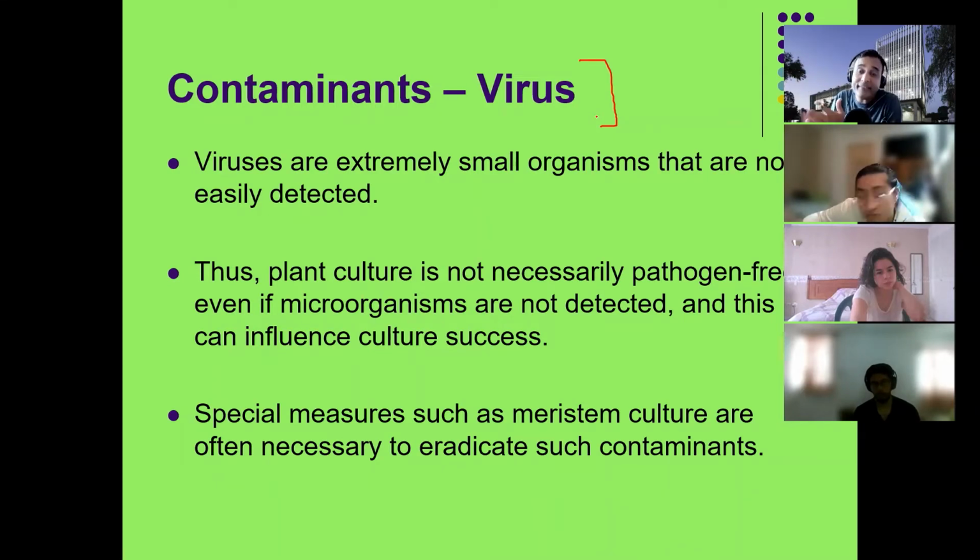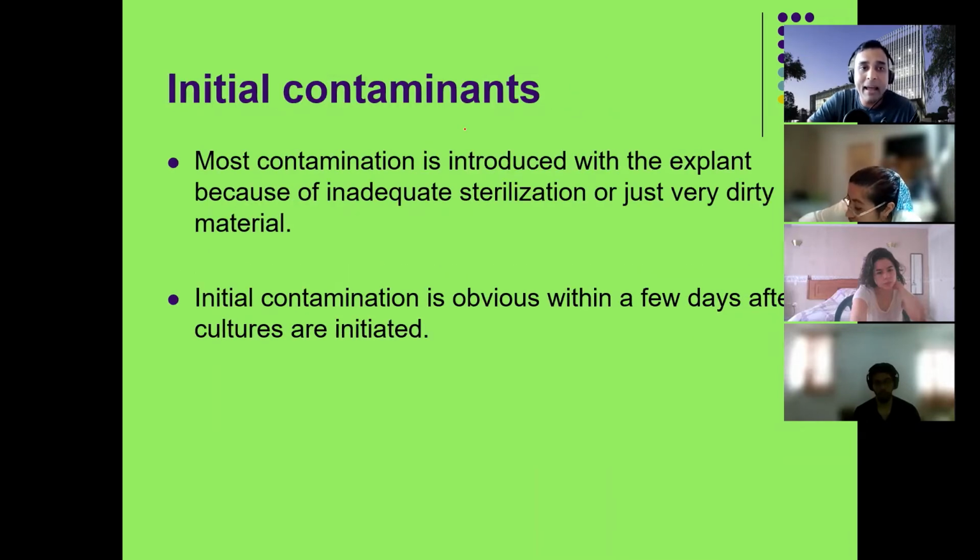In some cases there are heat treatments. You can put your plant at a certain temperature for a certain period of time in a growing condition. We know that after a few days, the virus, if it is there, will be killed. So these are other methods.